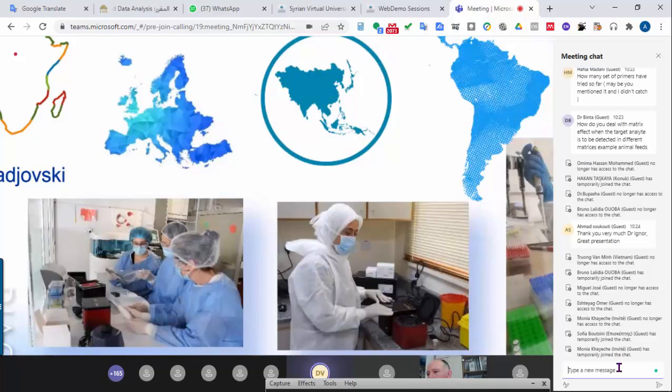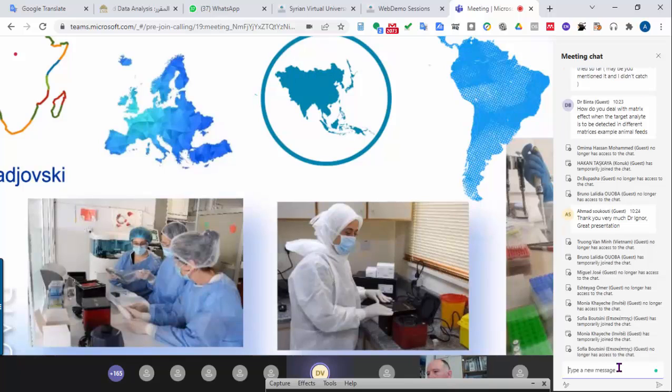So we have 3 unsuccessful primers and probes that were not so specific, and only when we designed the 4th time we got very good specificity and also sensitivity. So it was not as easy as it may look.